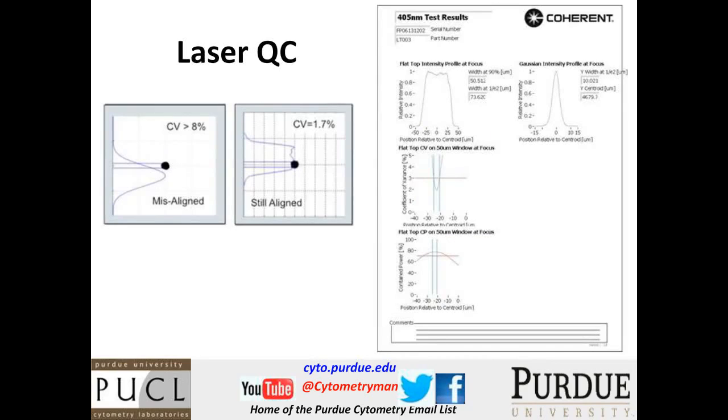I'm actually going to jump this slide and come back to it. This is what the laser signal would look like if you were able to see this on your machine. Actually, the specification of the laser is such that it has to have this format of beam. We call this a tophat, or the Attune uses the term flattop.